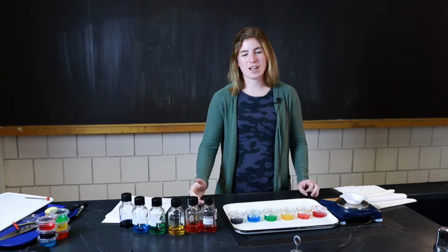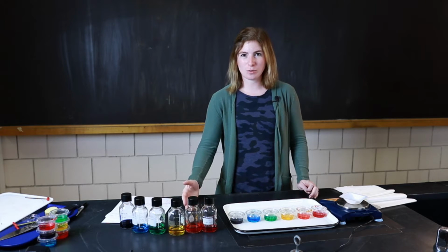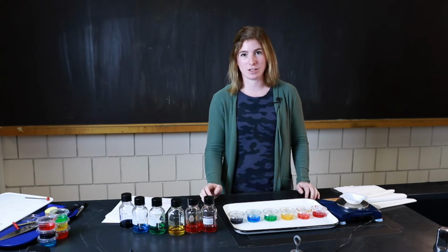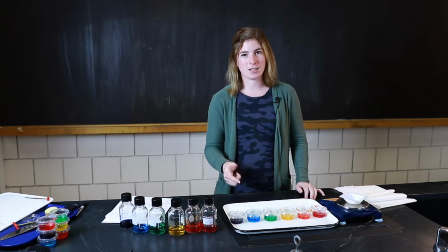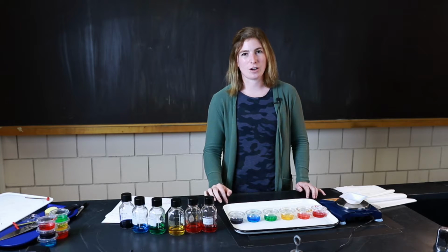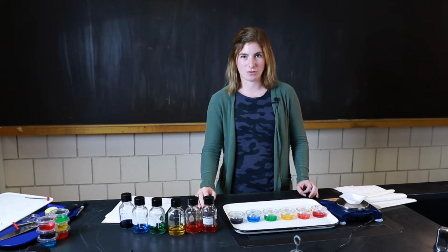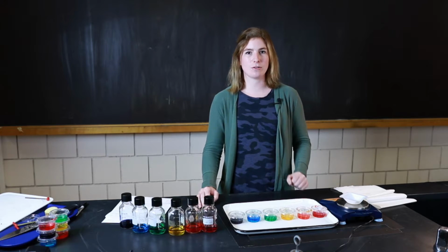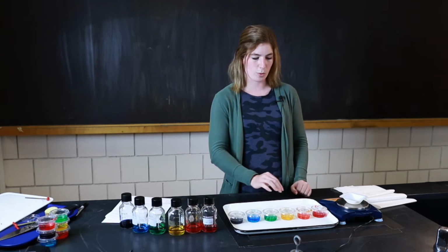All right, so now you should have recorded all of your initial masses, and I've pulled out the ones that correspond with those initial masses that you wrote down. And these have been sitting since yesterday afternoon. Now what we're going to do is figure out what the final mass is for each of these groups of potatoes. So I'll start with red and work my way down, so it should match up with your table perfectly.